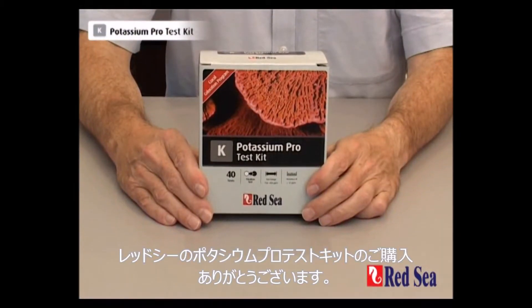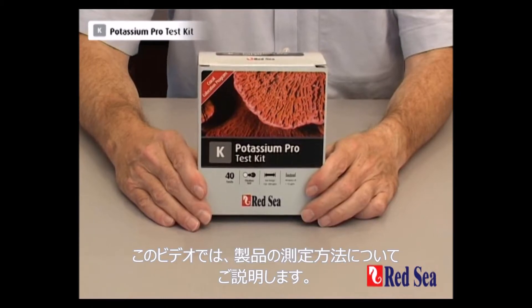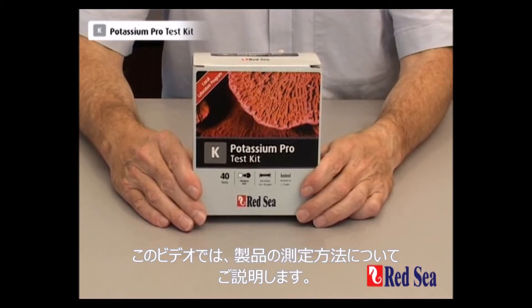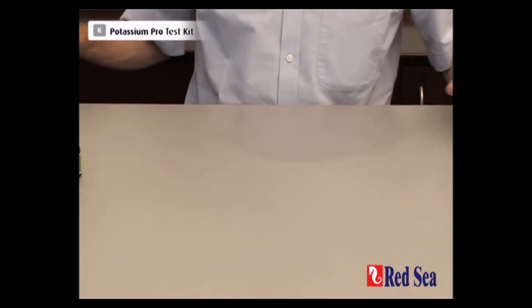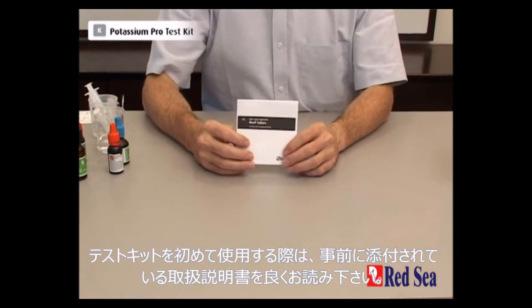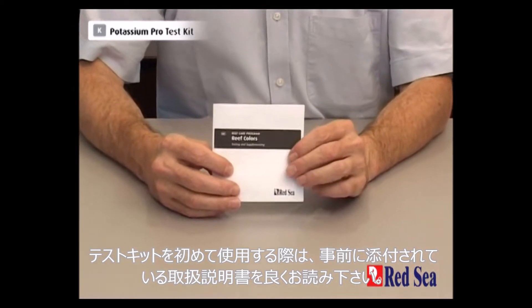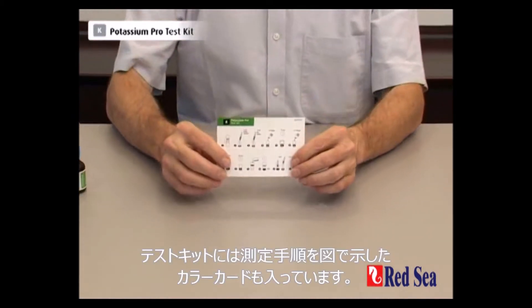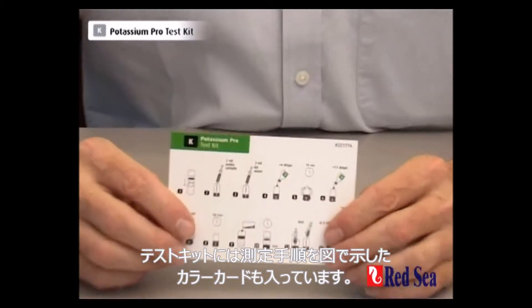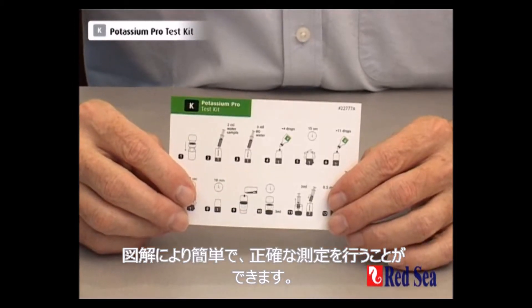Thank you for buying Red Sea's Potassium Pro test kit. The purpose of this video is to demonstrate how the test is performed. Before doing the test for the first time, read the instructions enclosed in the manual provided with the kit. There is also a color card giving simple graphic instructions to follow while you're actually performing the test.